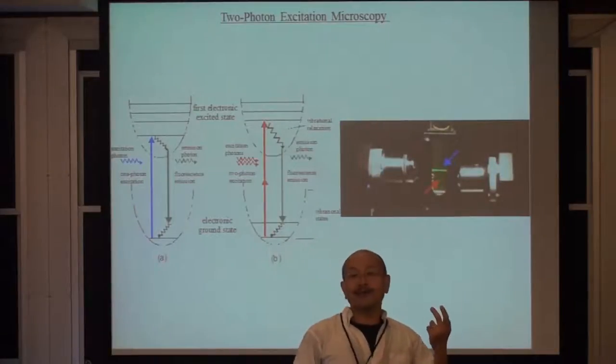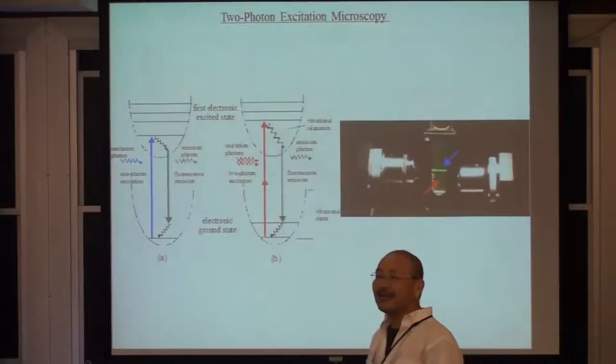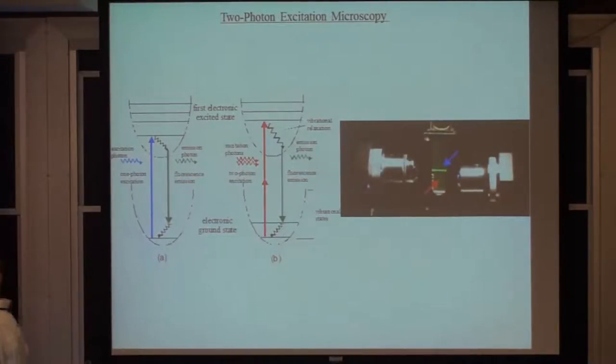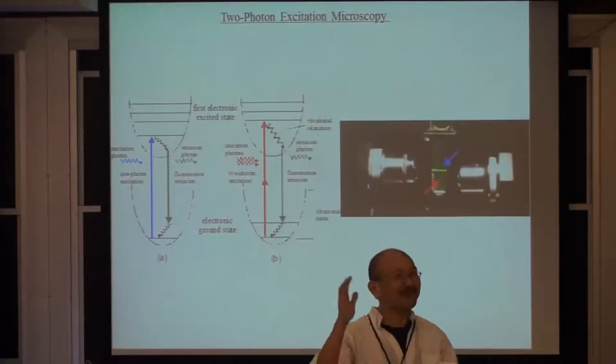You guys all used little lasers in the lab the last few days, including the little terrible blue laser pointer that generates terrible optical spots. But those are cheap laser pointers, $300. We decided to buy it so that we can do the GFP experiment mostly for this class.